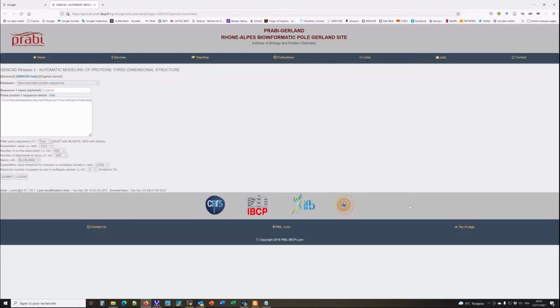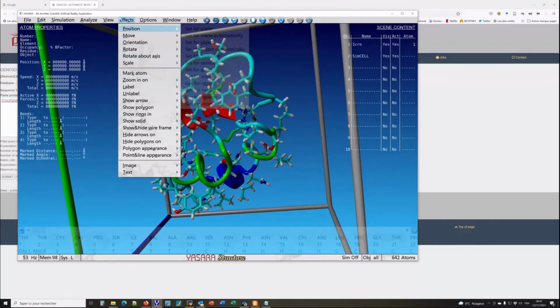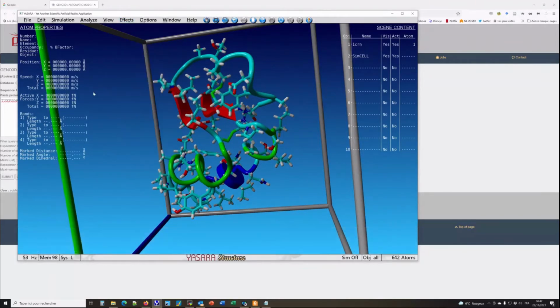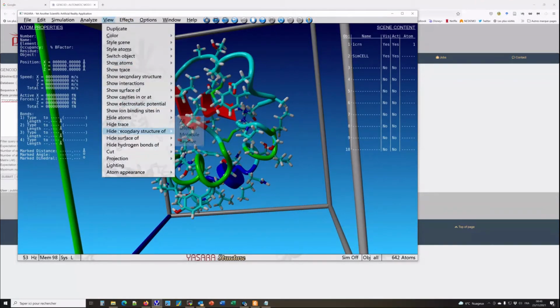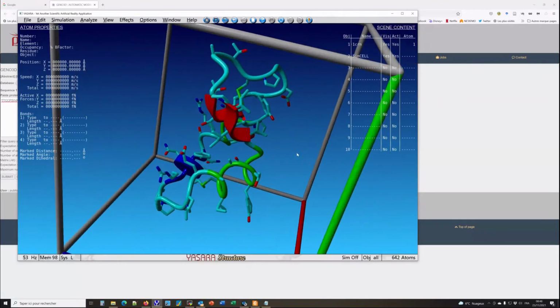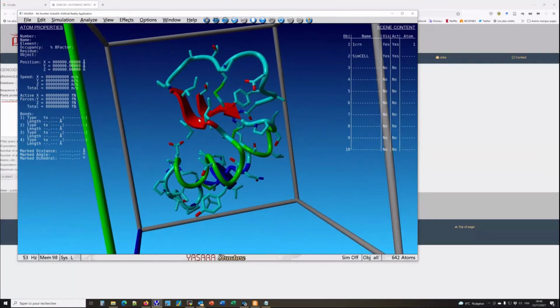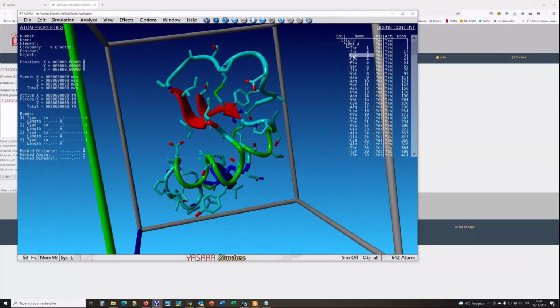Oh, can I count this as a bridge? I have to add all atoms, but I want just to show, okay. Just I answer the questions before. Okay, the best options, well, view, hide atoms, hide hydrogens. Okay. Well, if you want, okay, so I remove hydrogen from this structure, and I'm checking the best options. Maybe this one is good.